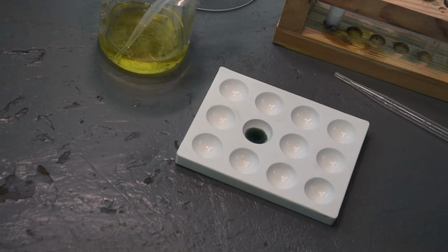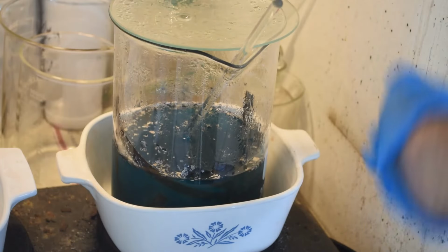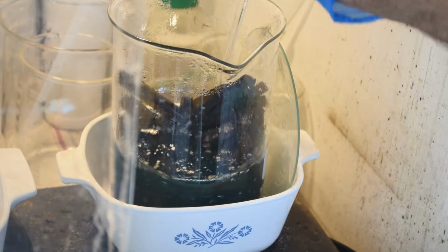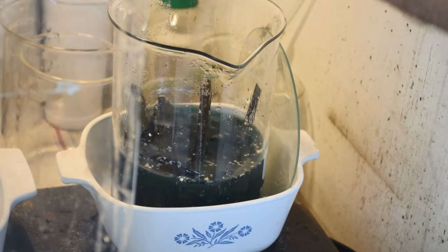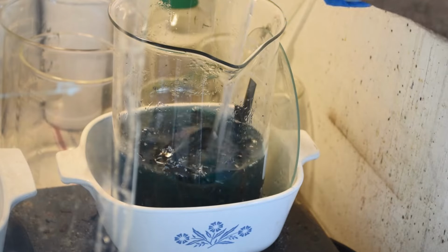All right, so next step is I've got to figure out how to separate the palladium from the base metal efficiently. All right, I'll give that some thought. So I think it's pretty obvious at this point there's nothing else I want to do with this. I got the heat turned off. Hopefully all the nitric acid in there is used up or about to get used up, dissolving the copper, and the palladium foils there are just going to be left behind. And I will endeavor to separate the palladium foils from the rest of this stuff.